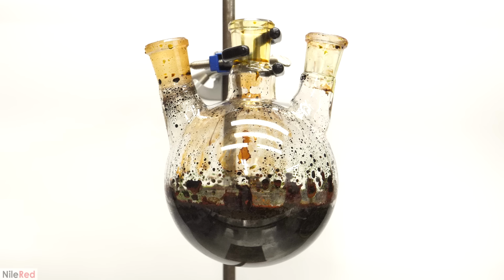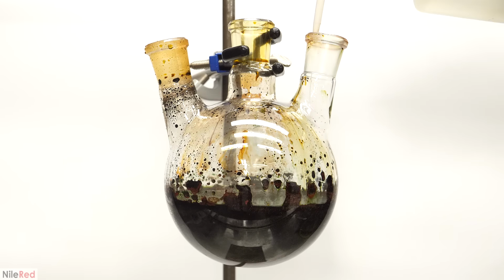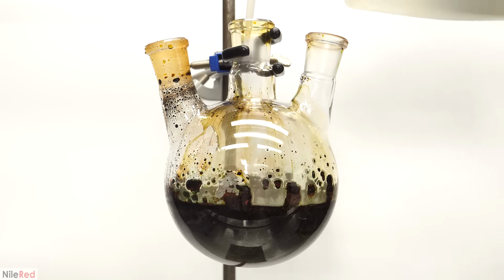So now I went back to the flask, which was full of the reaction side products, as well as a bunch of chromyl chloride. The side products themselves were safe and non-toxic, and ideally, I would have just separated them out and thrown them in the garbage. However, they were unfortunately all mixed in with the chromium, and it wasn't really worth trying to separate. But anyway, to deal with this, the first thing that I did was add a bunch of sodium sulfite solution to destroy any chromium-6 that was there.